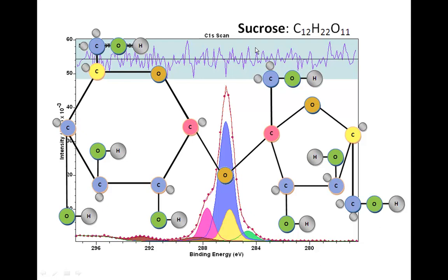But if we look at this particular spectrum, this is the first spectrum in a sequence of spectra that were measured that I will subsequently use. But understanding how a peak model applies to this data might give some insight into what I'm actually going to do when I calculate these line shapes.